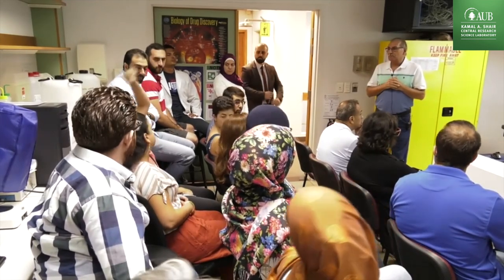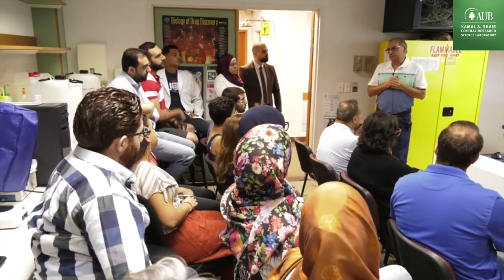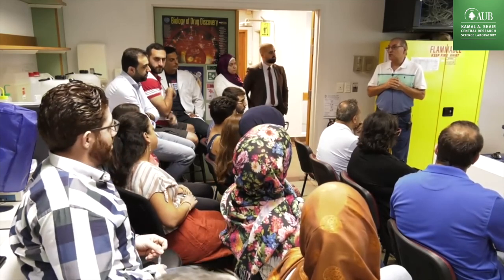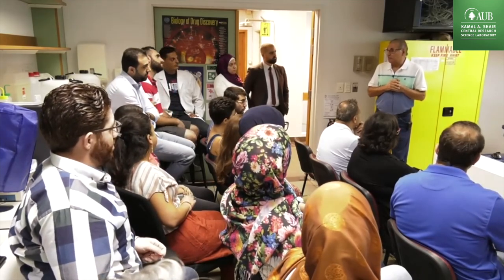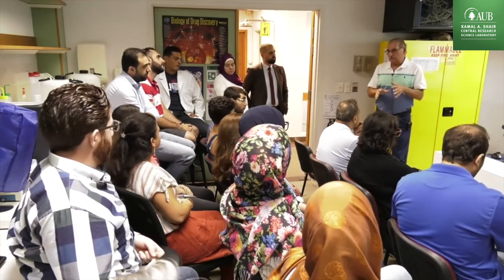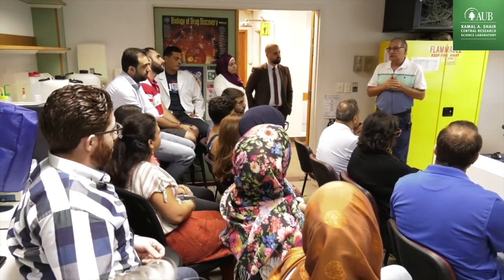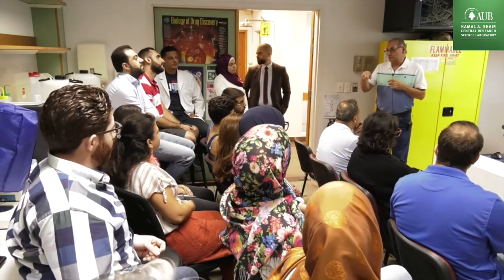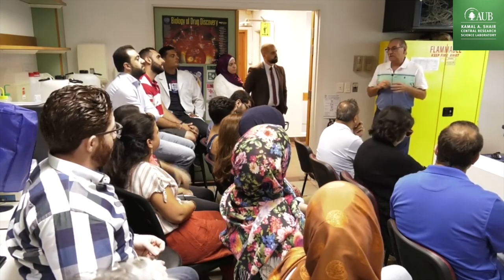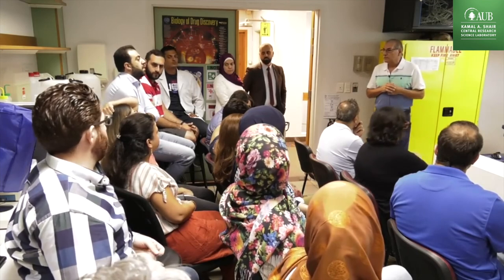What is the minimum detection limit for this device? 5 ppm of hydrogen. It has a gold-plated filament, so you can do, for example, sulfide, no problem, as long as your system can hold it, the TCD can hold it, because it has a gold-plated filament. And I'm leaving tomorrow, and next Saturday I'm coming to Spain to finish all the testing, and we have to deliver the system.